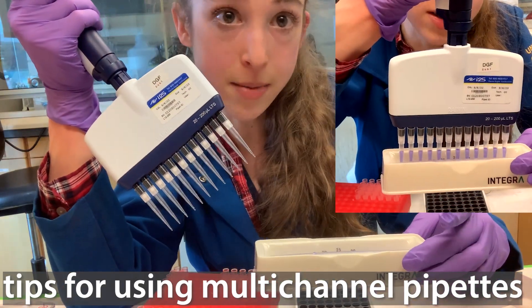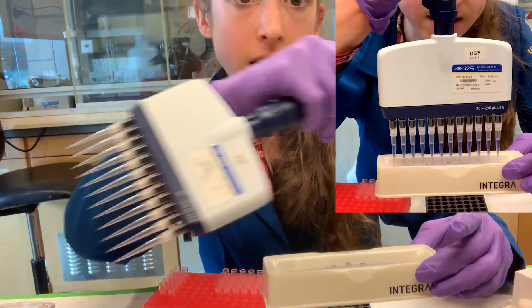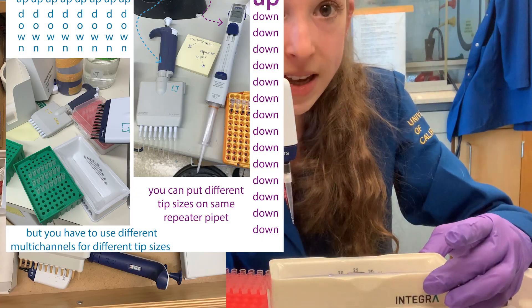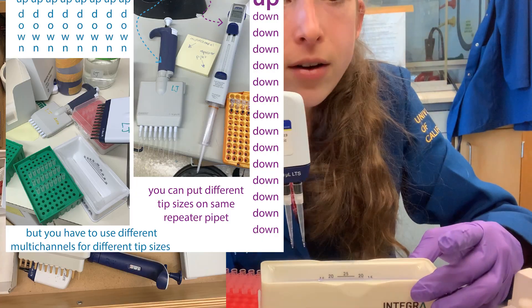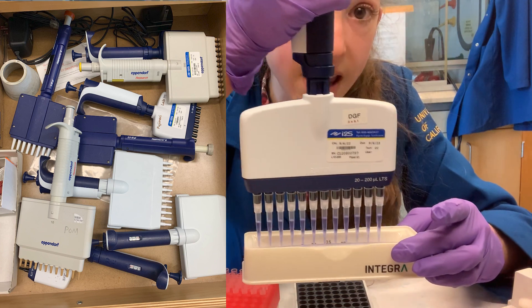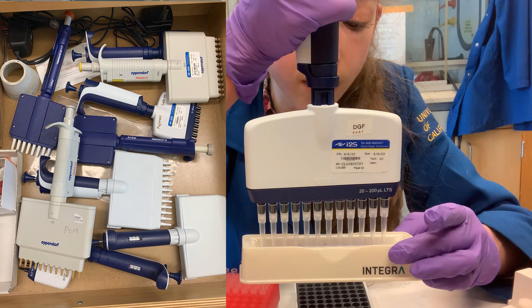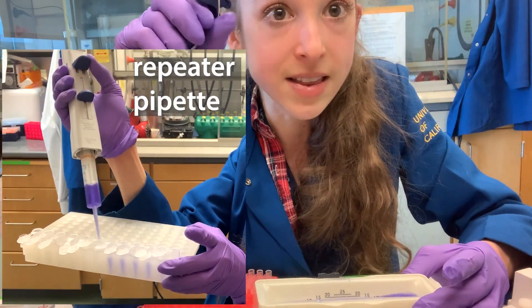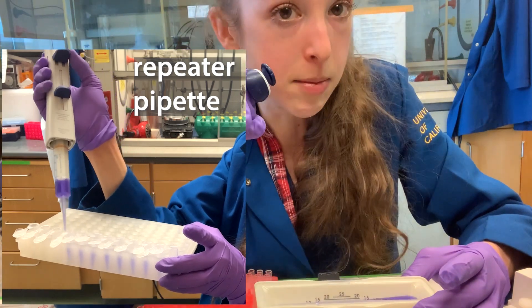Multi-channel pipettes can be a huge time saver when you have a lot of tubes or samples that you need to pipette from one place to another. Like a normal pipette, you aspirate once and dispense a single volume. Unlike a repeater pipette, where you suck up once and then dispense the same amount over and over, with a multi-channel you're dispensing simultaneously across multiple channels.